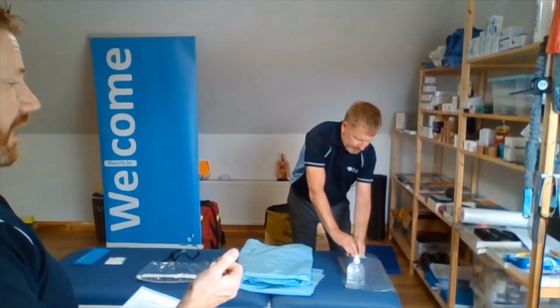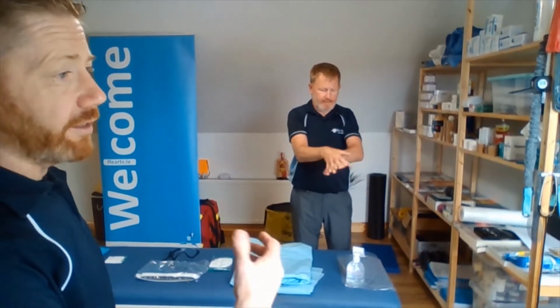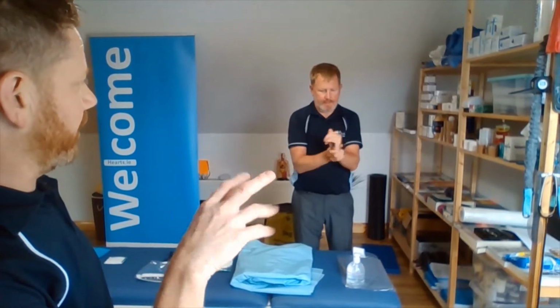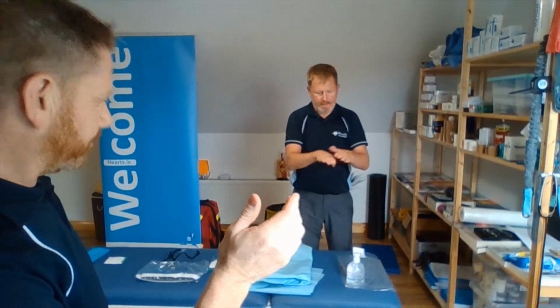If you wash and sanitize your hands, either with soapy water or, in this case, an alcohol rub, the standard protocol is to sanitize for at least approximately 20 seconds. Sean is getting in between the fingers up to the wrists, in around the thumbs, and making sure he gets the palms and the centers of the hands as well.